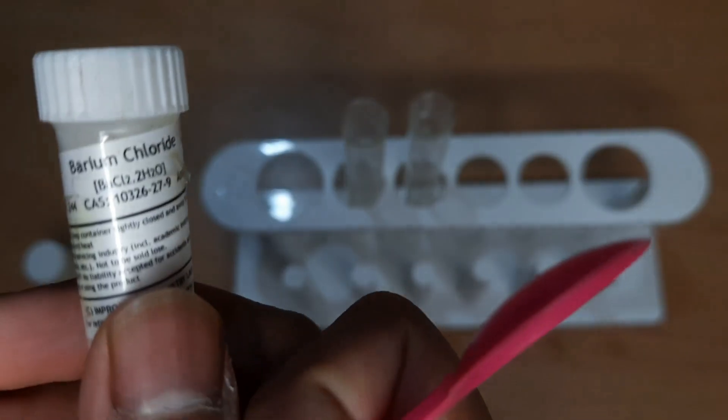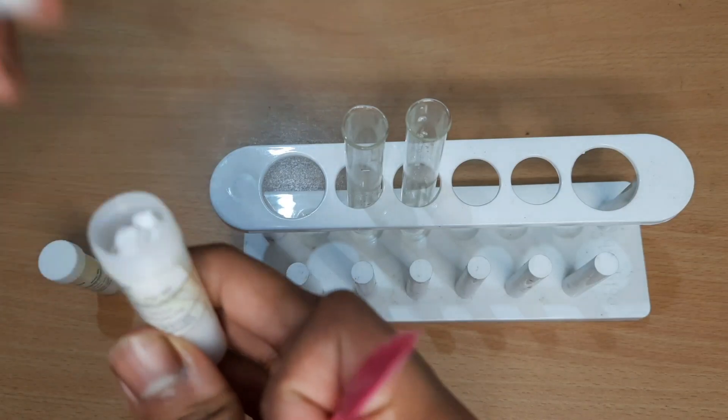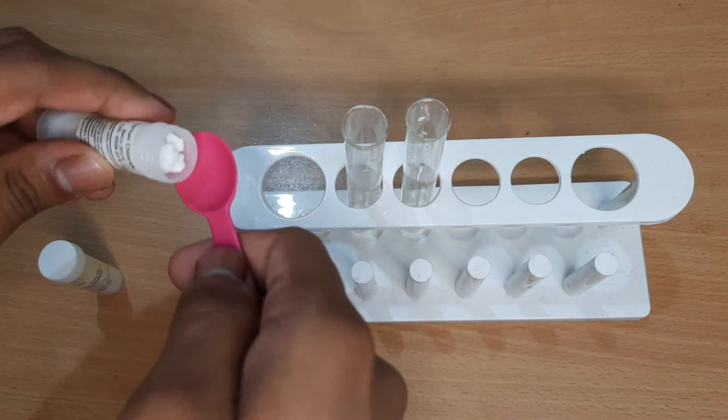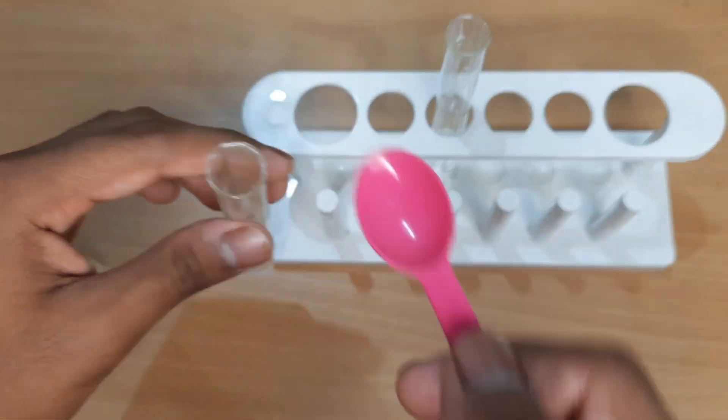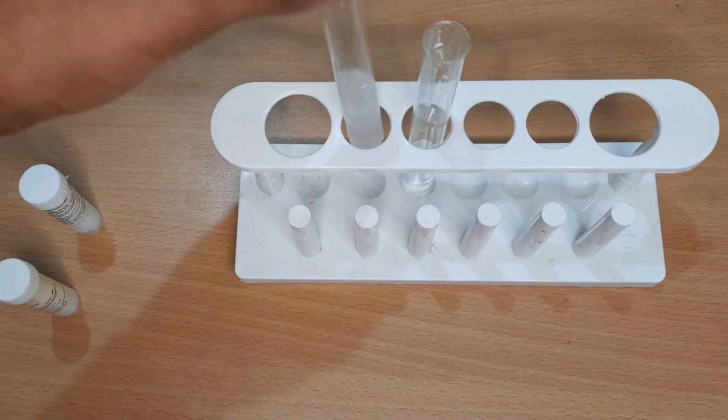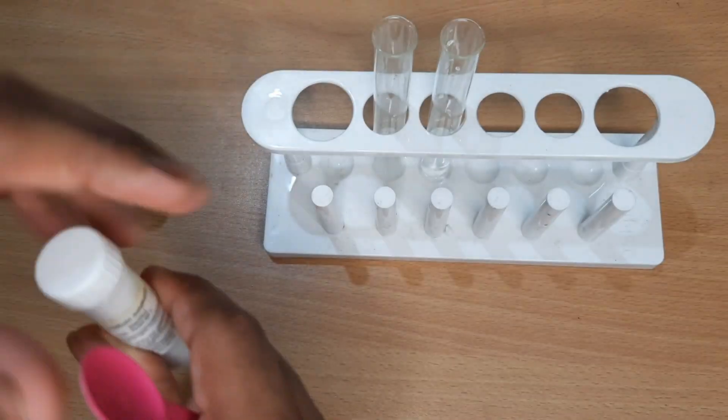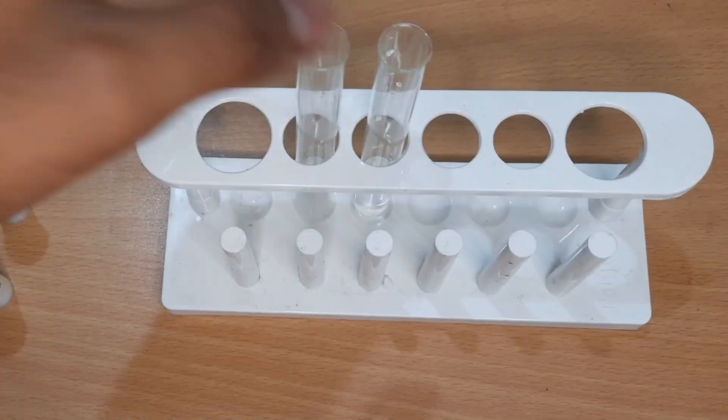Take about 3 ml of barium chloride solution in a test tube. In another test tube, take about 3 ml of sodium sulfate solution.